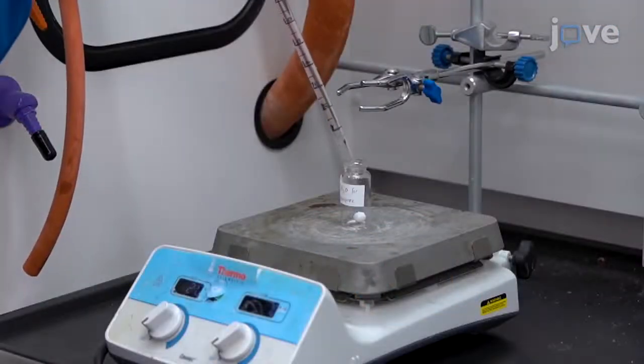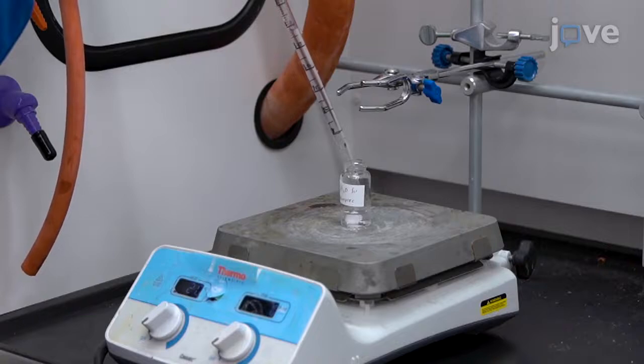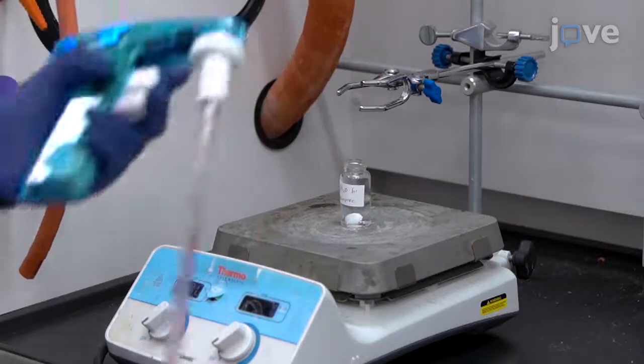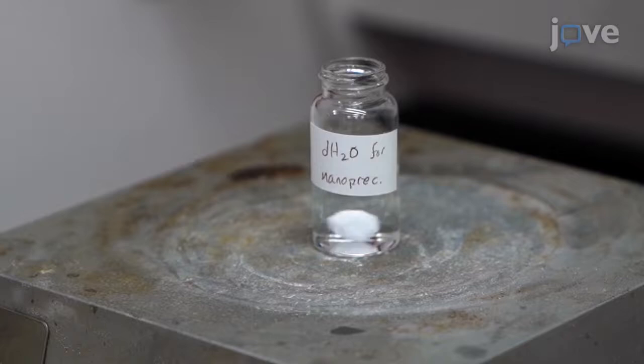Next, add 10 mL of ultrapure water to a 20 mL glass scintillation vial with a small stir bar and place the vial on a stir plate set to 600 rpm.